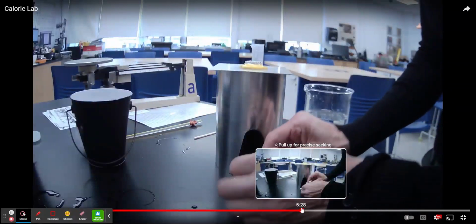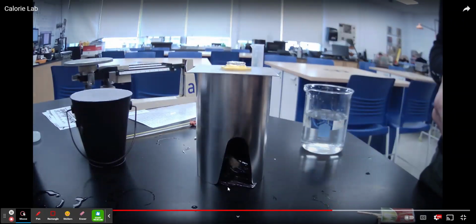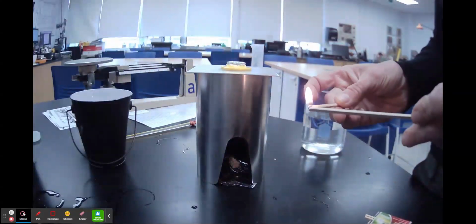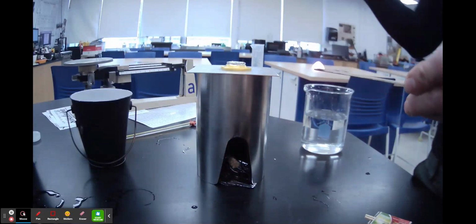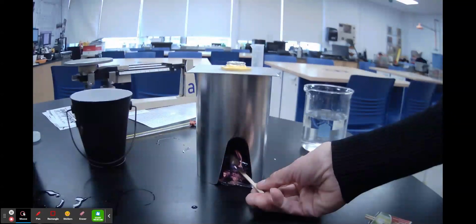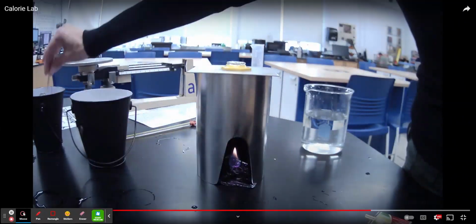Then you're going to place that food sample so that it's directly under the Erlenmeyer flask. You can pull the paper clip a little further apart. You're going to place the container over the material, again, making sure that it's as close to the Erlenmeyer flask as possible. You'll take a wood splint and light it with a match. Once the wood splint is burning, put the match in the bucket with water, and then place the splint into the combustion chamber and set the food on fire. Once the food is burning sufficiently, put the splint in the bucket with sand because you can reuse the splints.